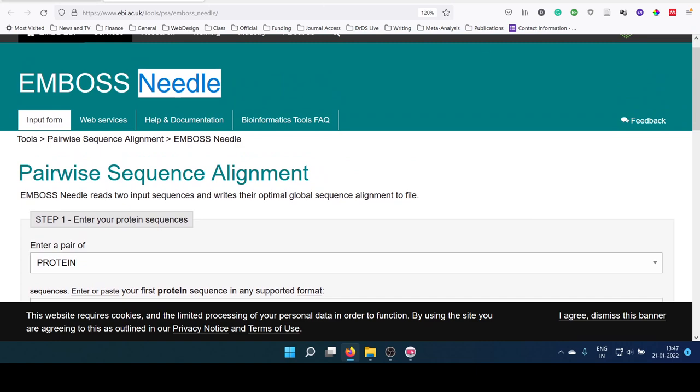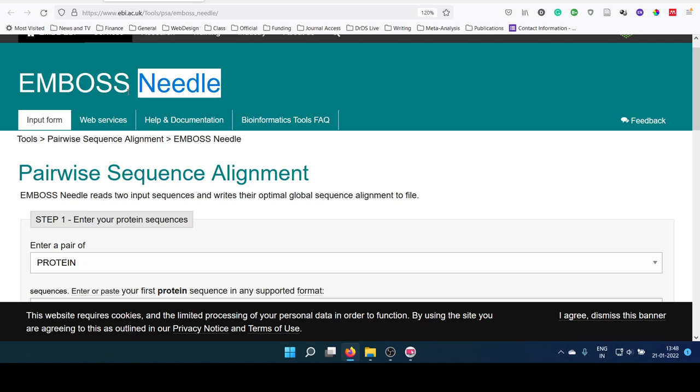This EMBOSS package and Needle program are available online through websites like EBI, or standalone programs of EMBOSS package can be installed in your own system. We can perform all this from the command line or using some graphical interface in the window system itself. Now, we are using the online platform of EBI, which provides the Needle tool of the EMBOSS package for pairwise alignment.